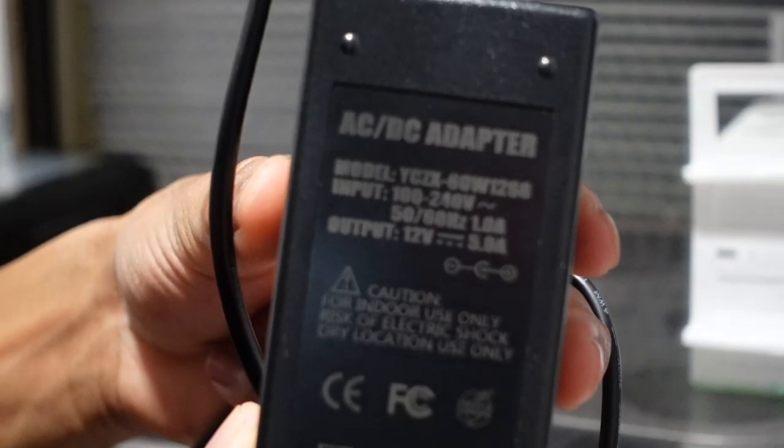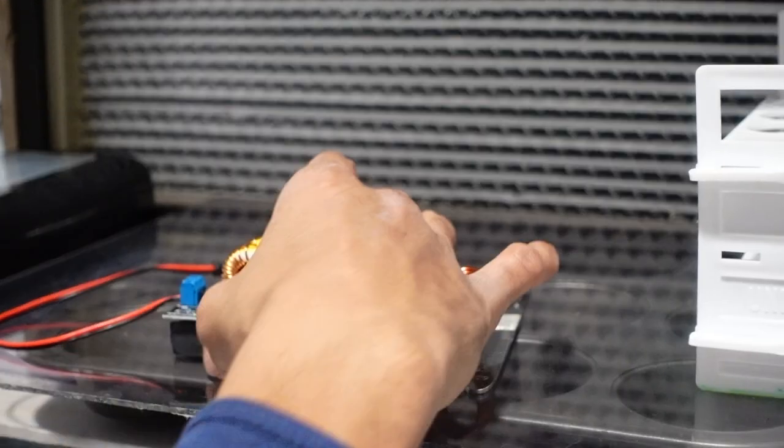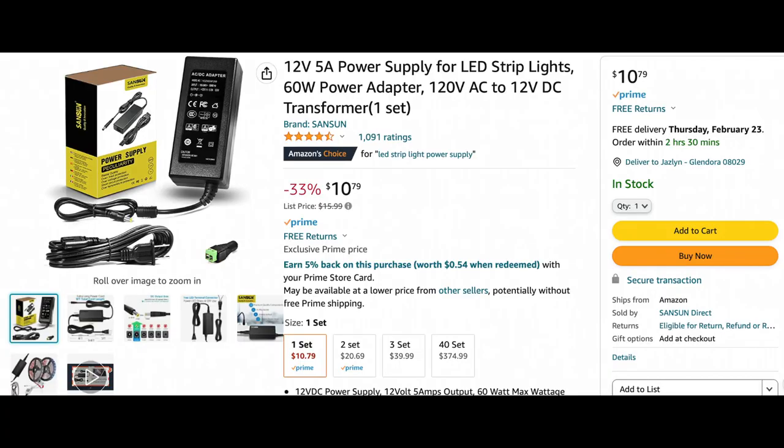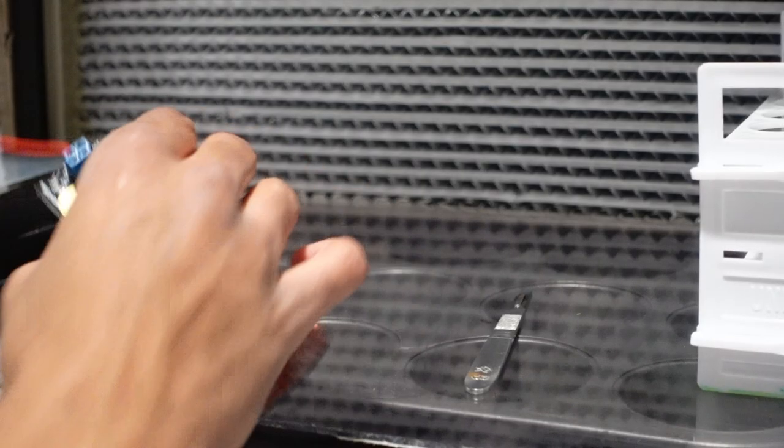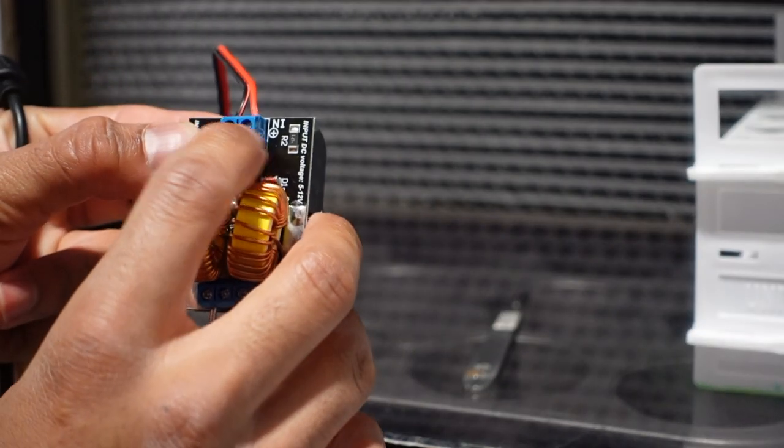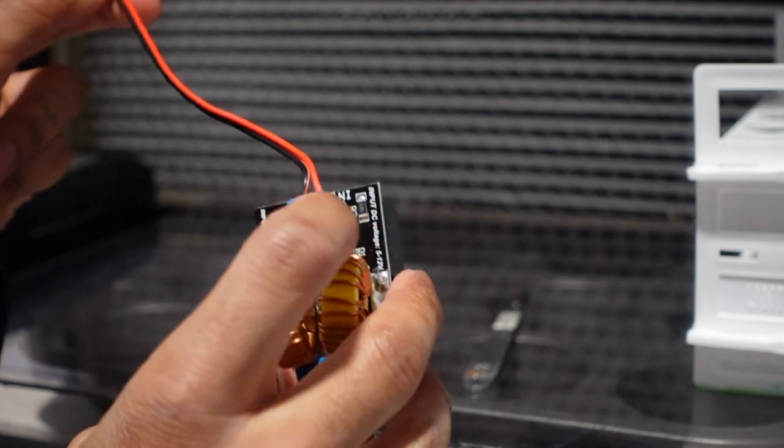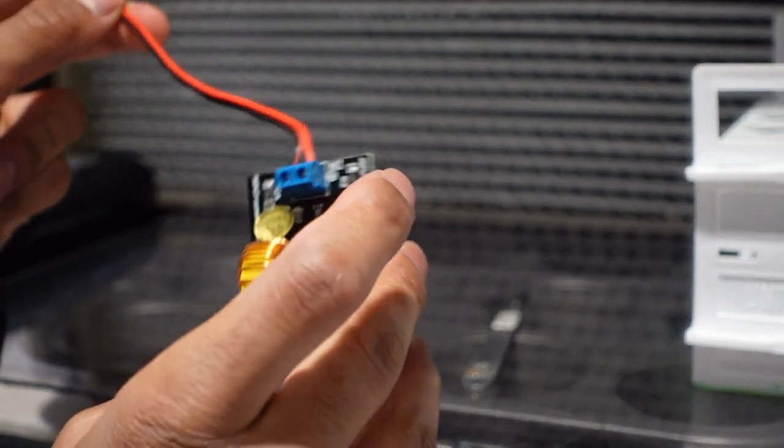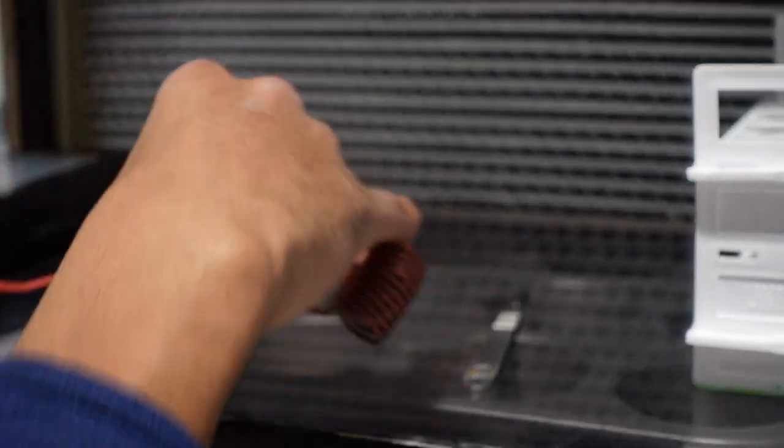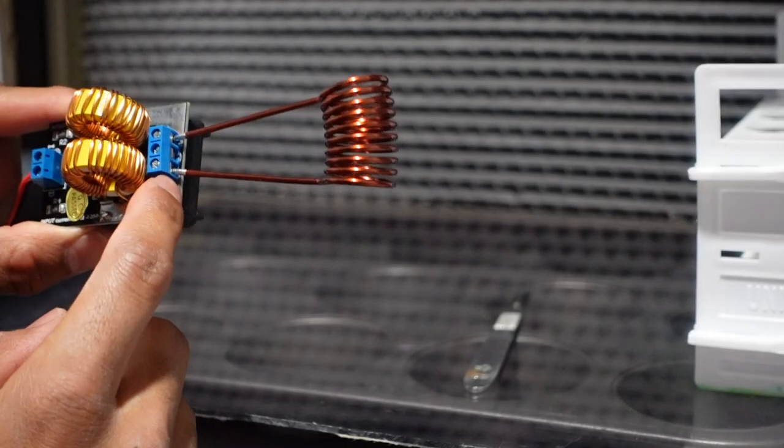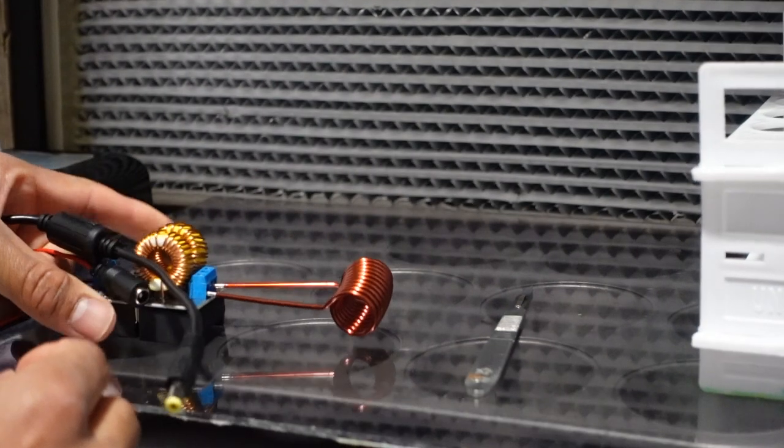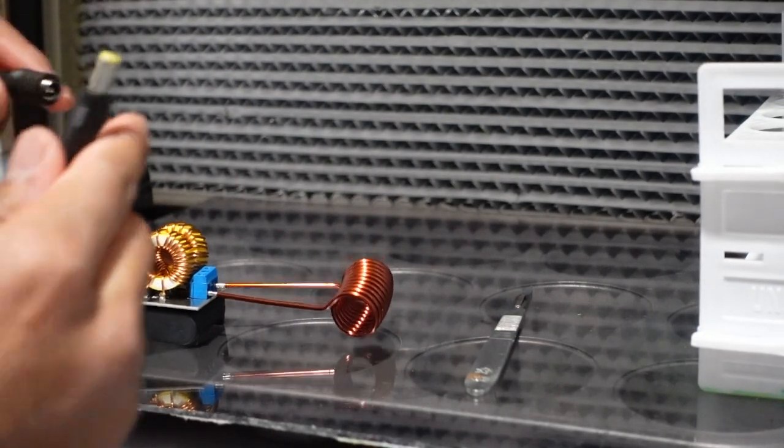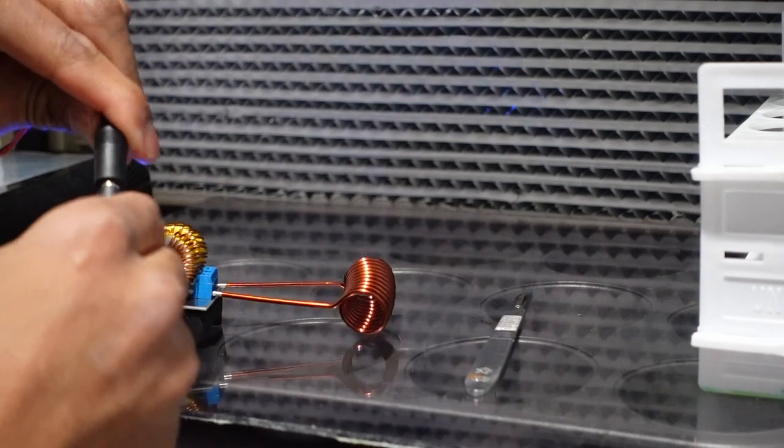This one has 12 volts and 5 amps. This little module, I screwed in my own pigtail female connector into the input side and I put the coil on the output side. So now we will be connecting this.